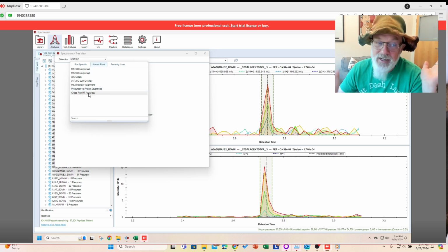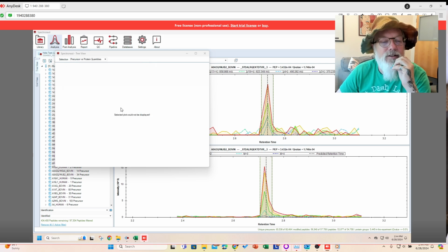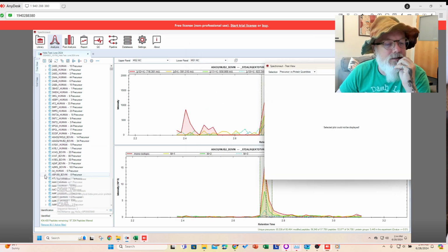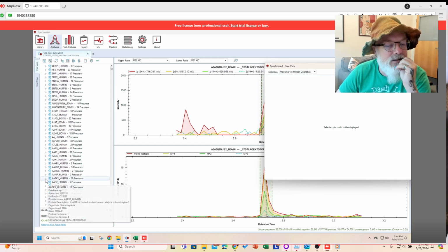And I'm going fast as usual, but you can pause it and rewind. Can you rewind a YouTube video or go backwards? Okay, so let's see. Why can that not be displayed? Okay, we'll just pick something else here. Oh, there is a lot of bovine in there, huh? You can see if that makes a difference.